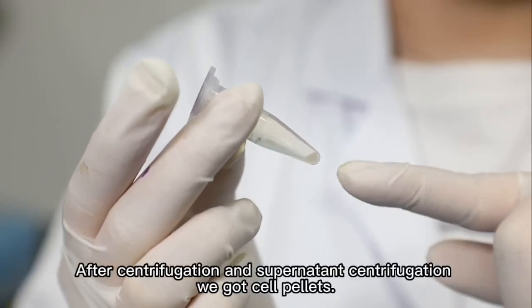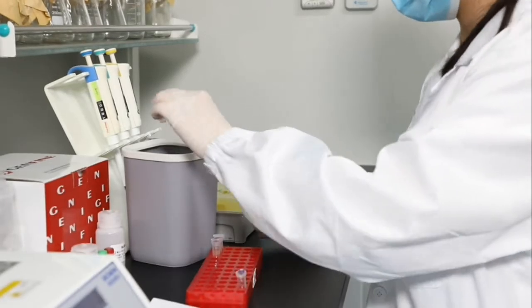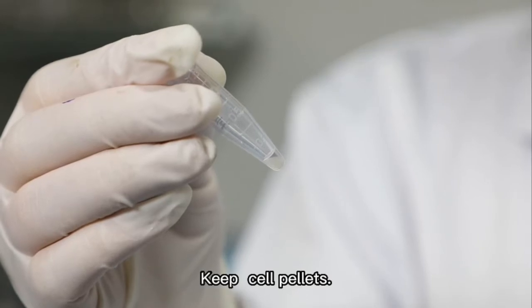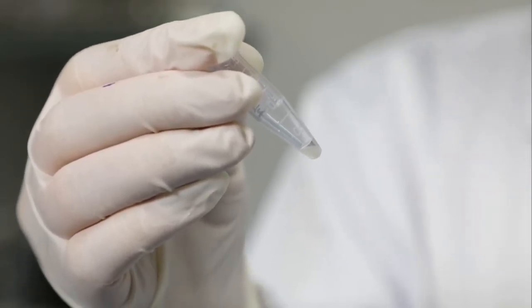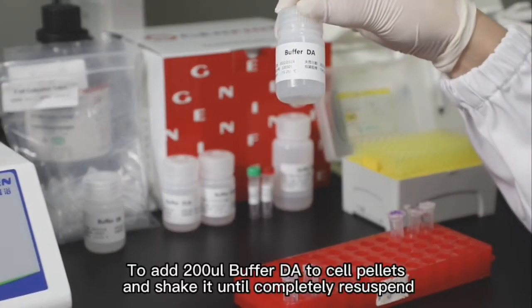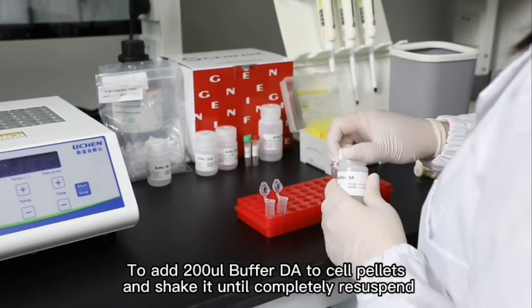After centrifugation and removing the supernatant, we get cell pellets. Step 3. Discard the supernatant. Keep the cell pellets. Add 200 microliters of buffer to the cell pellets, and shake until completely resuspended.